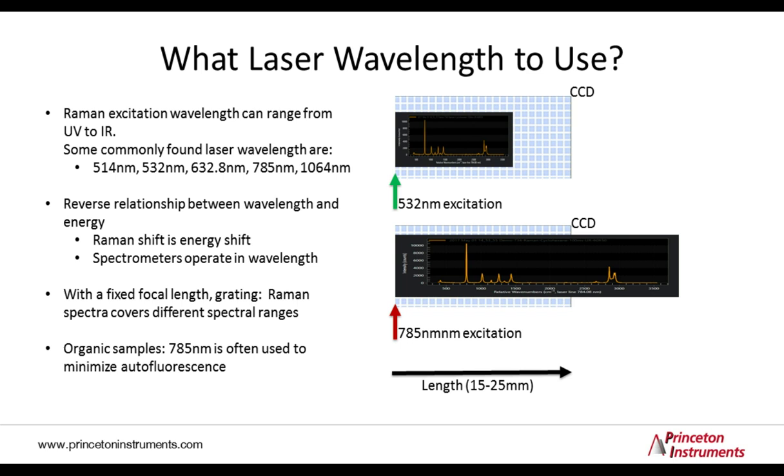So we compare this to the size of the CCD detector used. For the shorter wavelengths, as shown on the top, in this case the signal fits well within the detector, whereas for the longer wavelengths, part of the signal would be cut off in a single acquisition. However, it will be easier to measure higher resolutions at high excitation wavelengths due to the wider spread of the spectrum. On the other hand, one can use higher groove density gratings at shorter wavelengths.